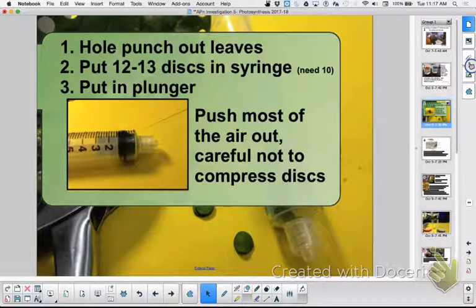Now, you'll see right here, I have labeled this one without. I would then put a piece of green tape on this one so that it matched. I don't have to write without on it. I know green goes with green, or you can write without. I have color tape up here, but you have color tape at your lab stations as well. Try to use as little tape as possible.